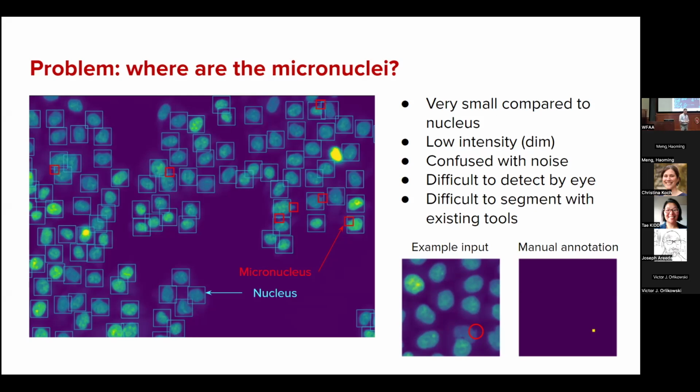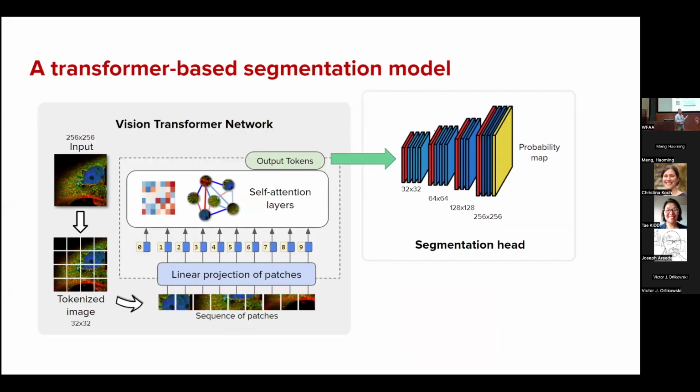So in this context, given the complexity of this pattern, what we wanted to try was a vision transformer network. And if you're following the machine learning trends, transformer networks are one of the most powerful machine learning algorithms that we currently have. They are behind the GPT type of models, for instance. So there is a version that we can use for images, which is called vision transformers.